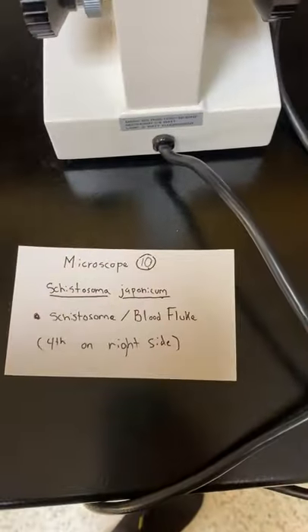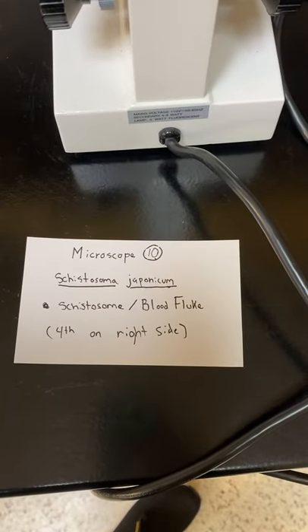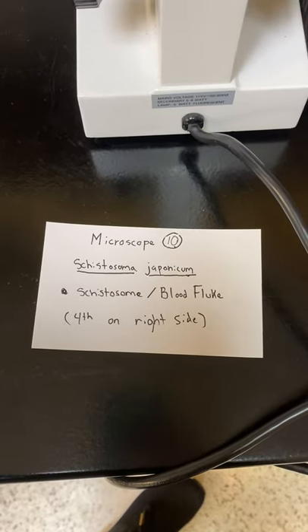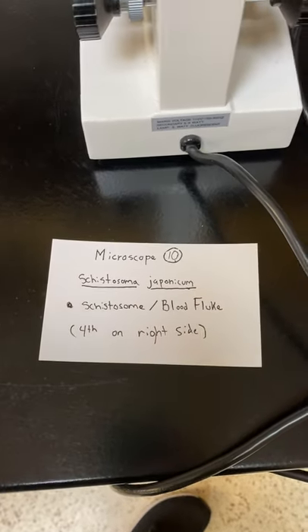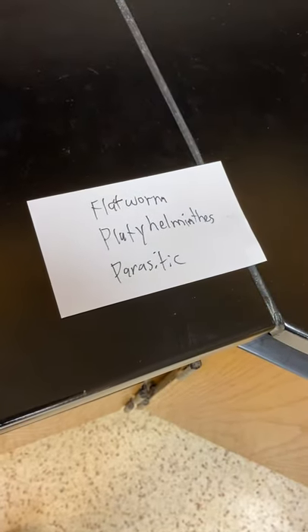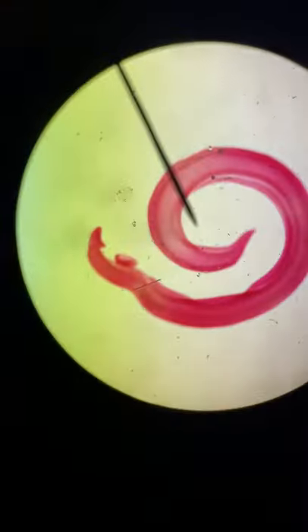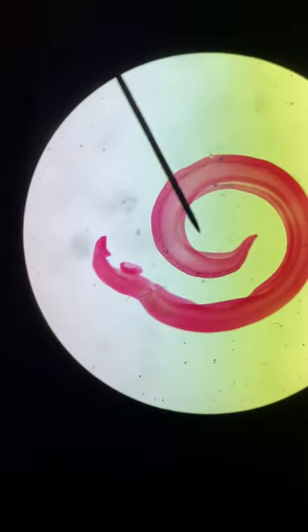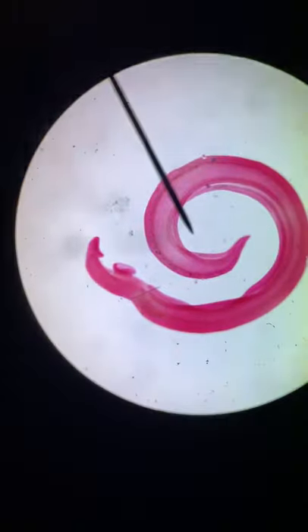Slide ten: this is the schistosome, or the blood fluke, that you saw on the Monsters Inside Me episode. The picture is on the right hand side, fourth one down. It is a flatworm, Platyhelminthes, and parasitic. Normally it has a tube coming out — it's kind of wrapped up inside itself right now, so it's hard to see.